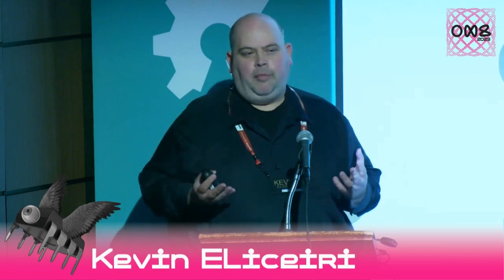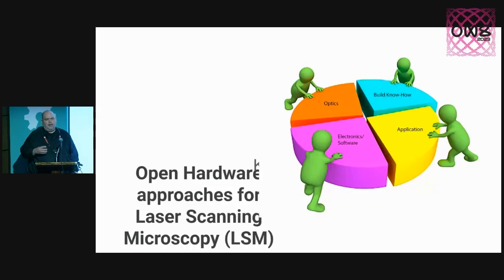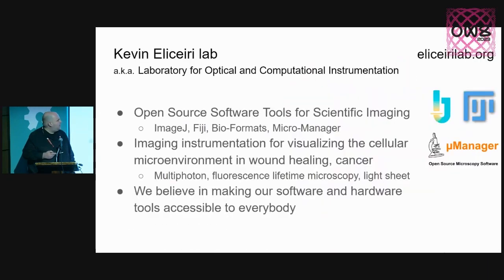My name is the K there. So we talk about open hardware approaches for laser scanning microscopy, and I'm kind of representing the science field that has historically been very good at sharing software. And we try to share everything in the papers, but usually the papers are very strong on what the samples are and what commercial microscopes you did. But if you get in the world of home built, at most we give you a parts list. And we're really finding that we've got to go beyond that. So thanks to this fellowship, that's exactly what we're trying to explore: how can we be more open in sharing the complete system, not just the methods.